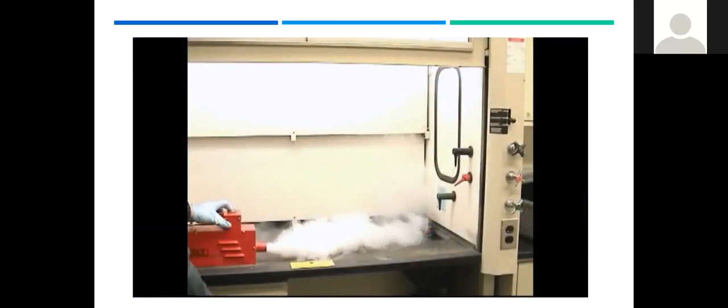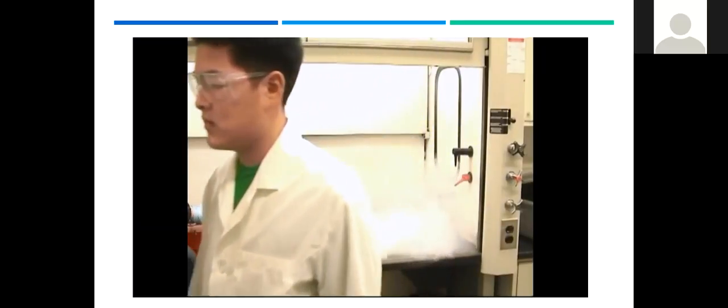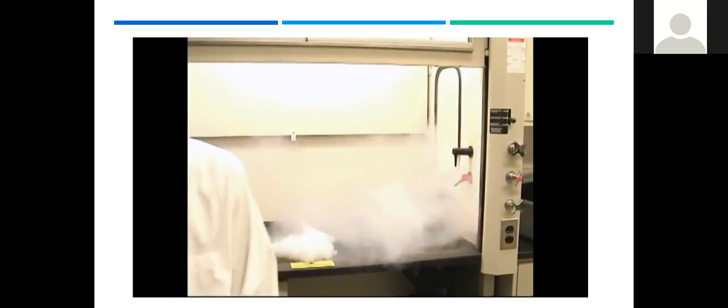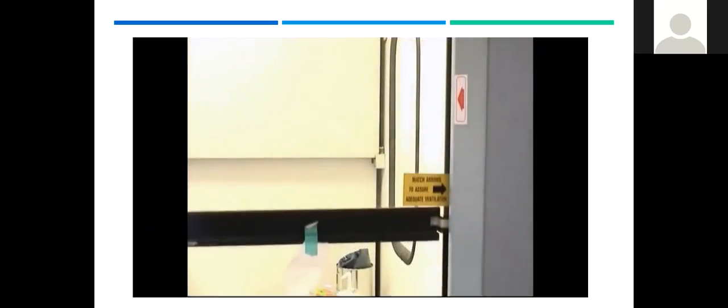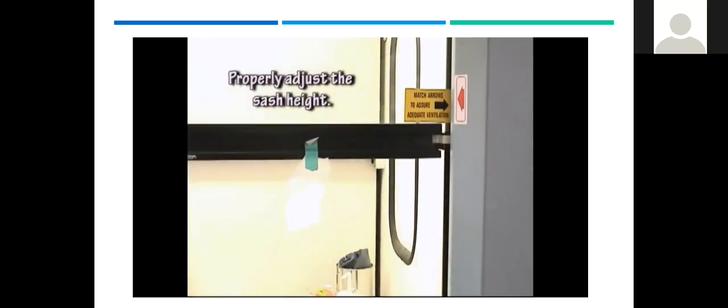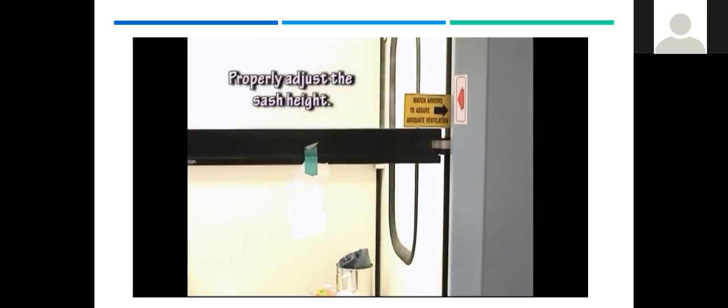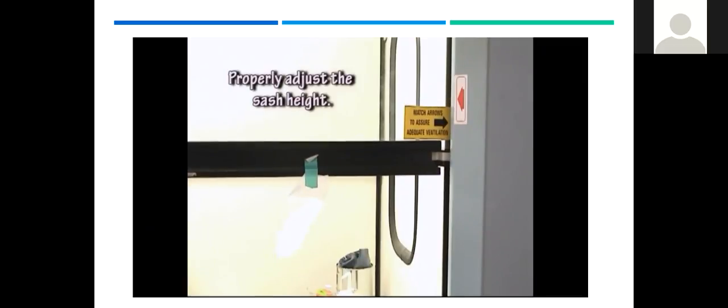Airflow turbulence at the front edge of the hood can draw airborne contaminants out of the hood. In this case, the sash is too high, and when someone walks by, the low inflow velocity allows the smoke to come out of the fume hood. Adjust the sash to the proper height. In this case, the glass sash was raised to the maximum working height, as indicated by the joined arrows, then slightly lowered. The tissue on the sash is drawn in, indicating that there is airflow into the hood.